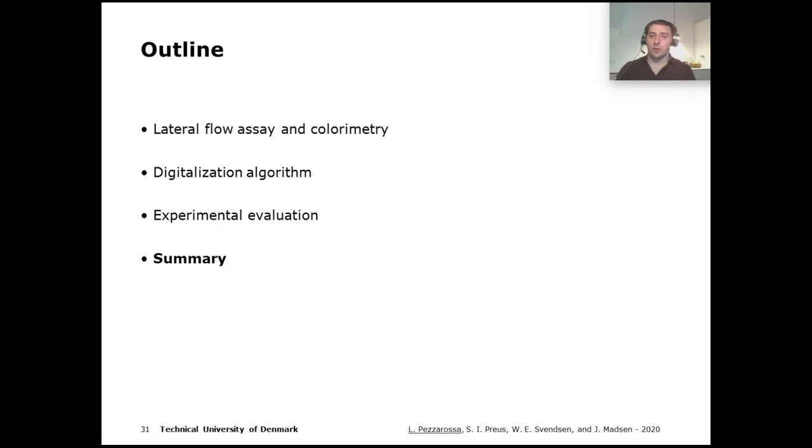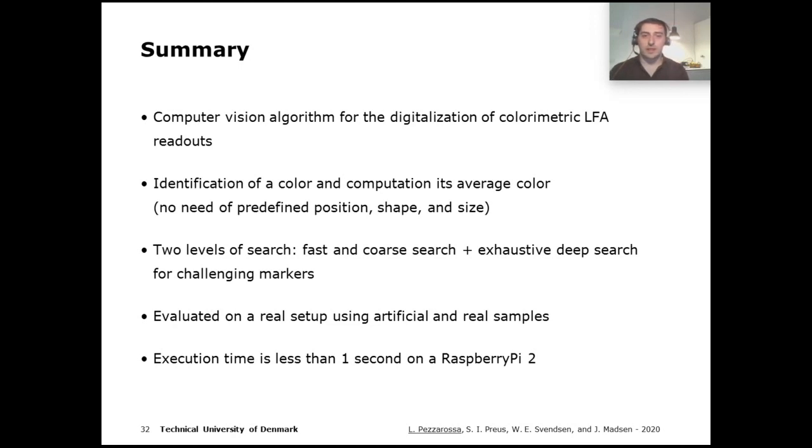So now we have a little summary of the contributions of this work. What we presented was a computer vision algorithm which is used for the digitalization of colorimetric lateral flow assay readouts. We used it in our project to identify the concentration of bacteria, but in principle it should be able to identify any concentration because it just reports the color of the marker.